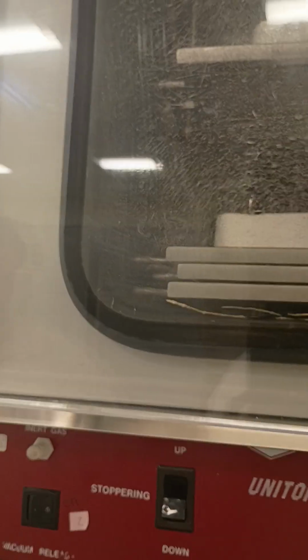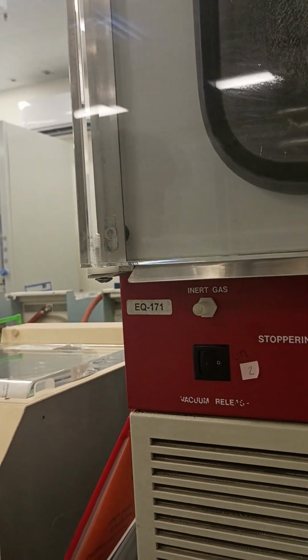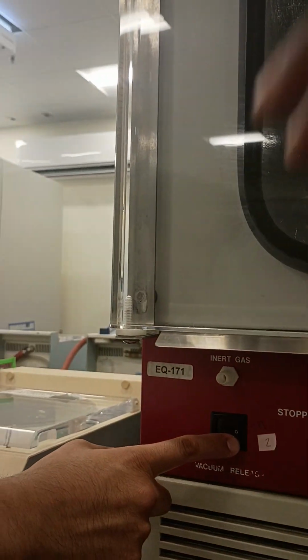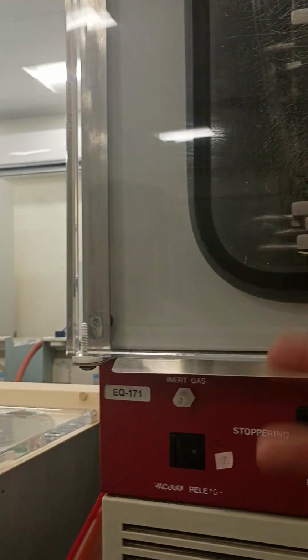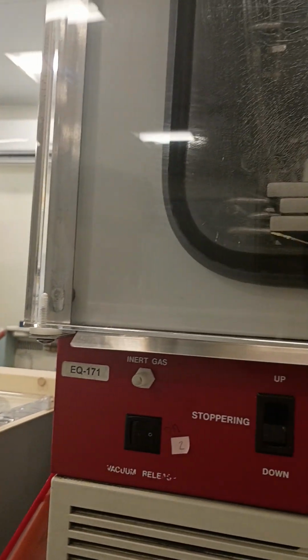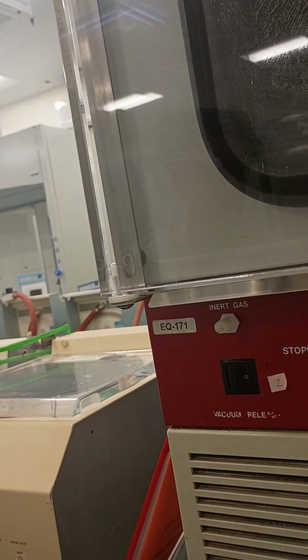You close the door and then you check to make sure it's sealed, and then you start the vacuum. On this one, you have to start the vacuum. Again, you're not going to do that, but I'm just giving you an example. So I put the sample in, and then I seal the door, I open the vacuum, and then I start the vacuum.